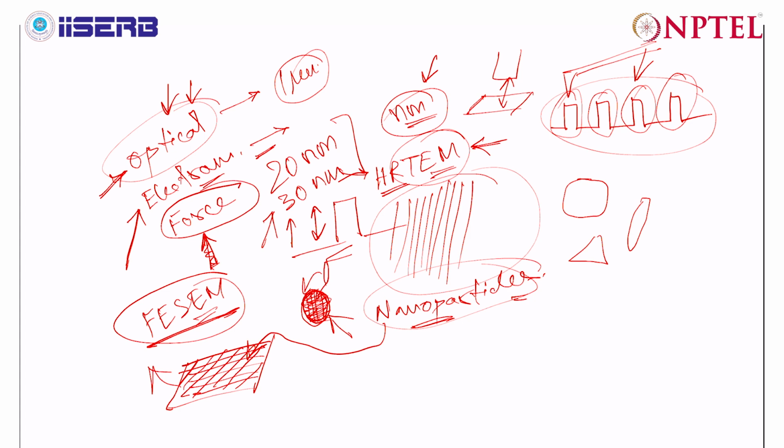And in conclusion, what I would say is, one should actually decide the characterization facility based on the sample in hand. If your sample is thin film and you do not need very small details on the surface, then it's better you go to SEM. In most of the cases, if it's a device, now you want to characterize the device electrode and so on, you can do it with optical microscope first.